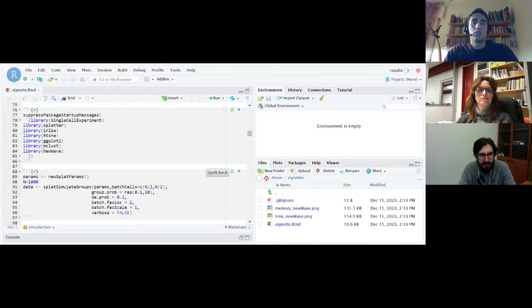Okay, so sorry, Federico, to interrupt. Perhaps this is a good place to stop for a second and see if you want to follow along the workshop. In my case, I started the RStudio session right when we started the workshop session, and now it's ready. Maybe I'll just do a quick poll. Are you able to run RStudio?